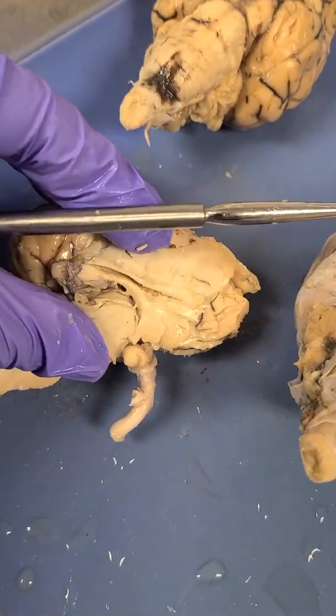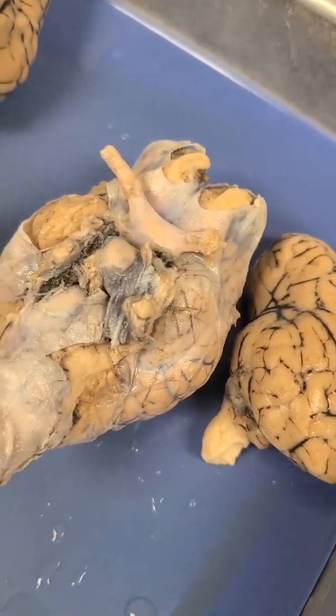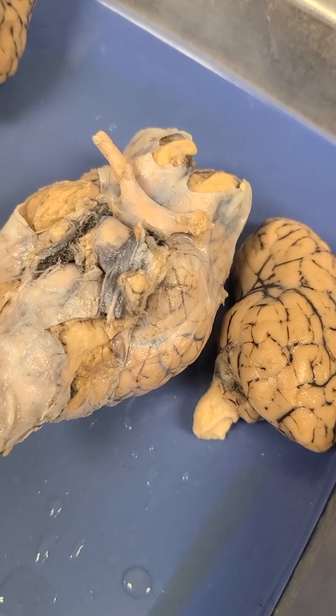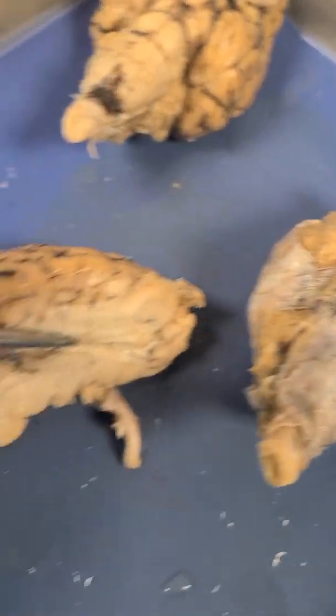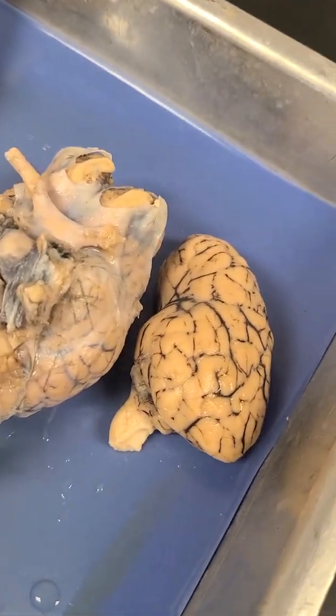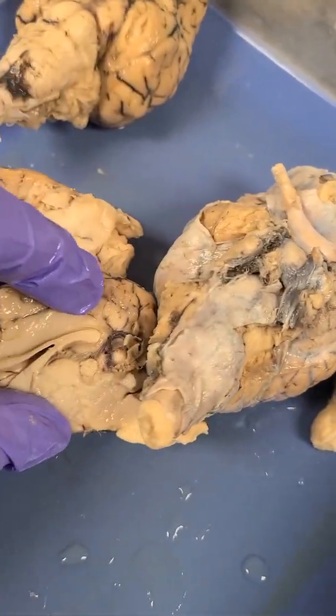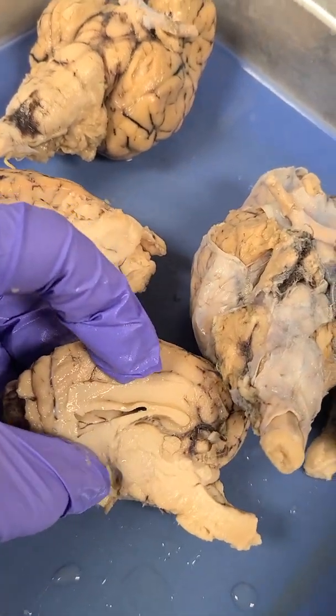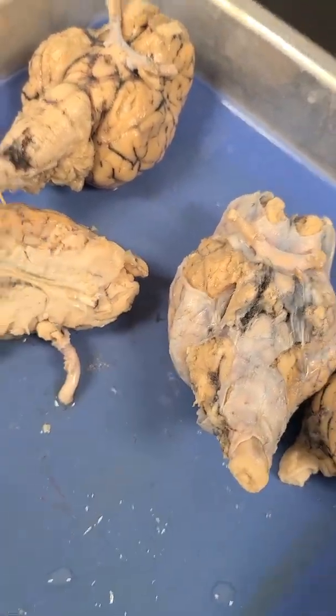Okay, so most noticeable, if I spread this out right here, hopefully you can see this opening right here. This is the lateral ventricle. Okay, there's two lateral ventricles. If we look at it on this one, might be easier to see that lateral ventricle is that hole right there.